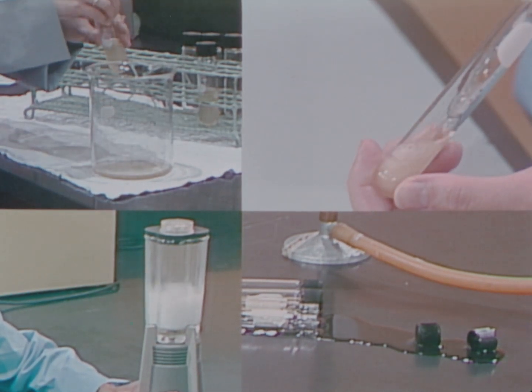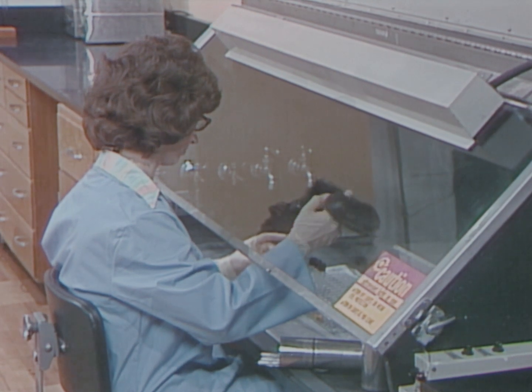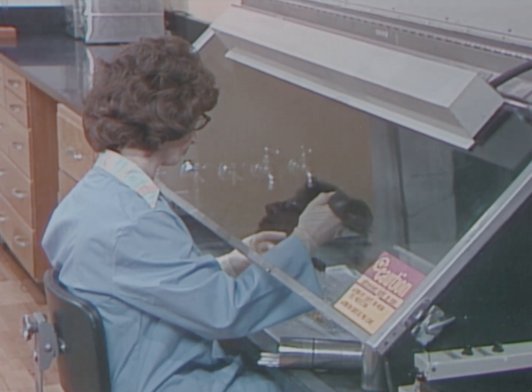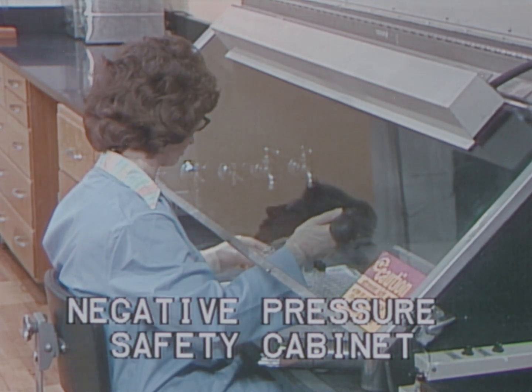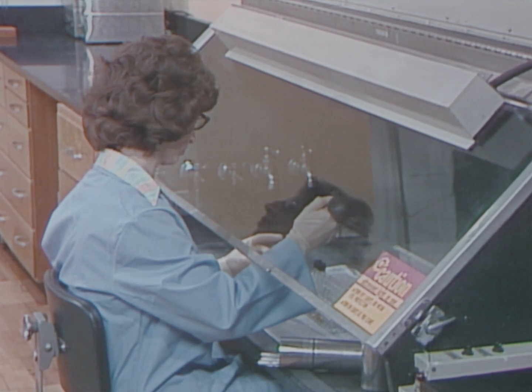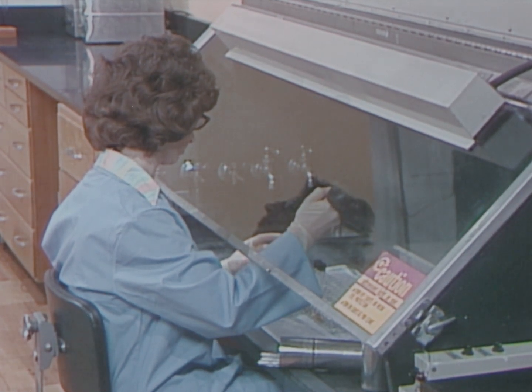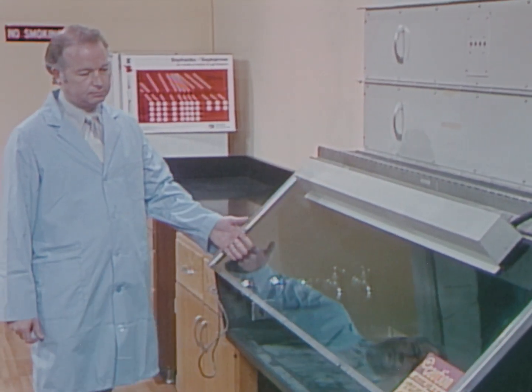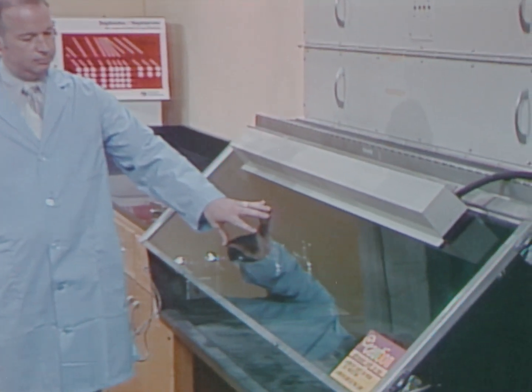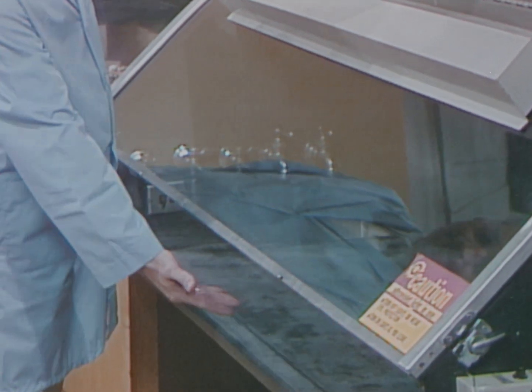They may then settle out and contaminate surfaces. Aerosols cannot always be eliminated, but their effects can be minimized through use of a biological safety cabinet. The biological safety cabinet, when used in conjunction with good microbiological technique, provides a safe environment for the laboratory worker. This negative pressure or class 1 unit is one type of safety cabinet. Another type is the laminar flow or class 2 cabinet. The negative pressure cabinet is usually 4 to 6 feet wide. A glass plate is located between the laboratorian and the work.